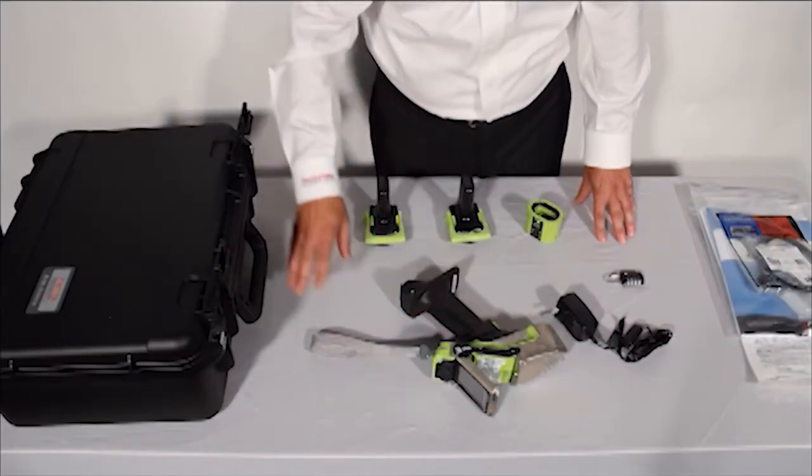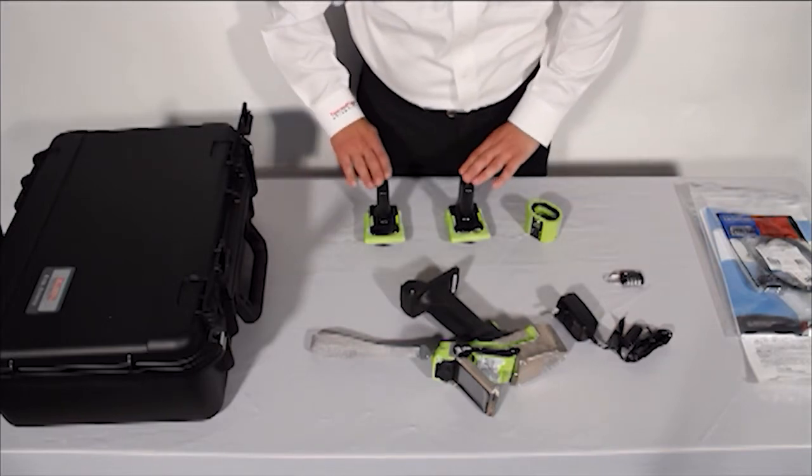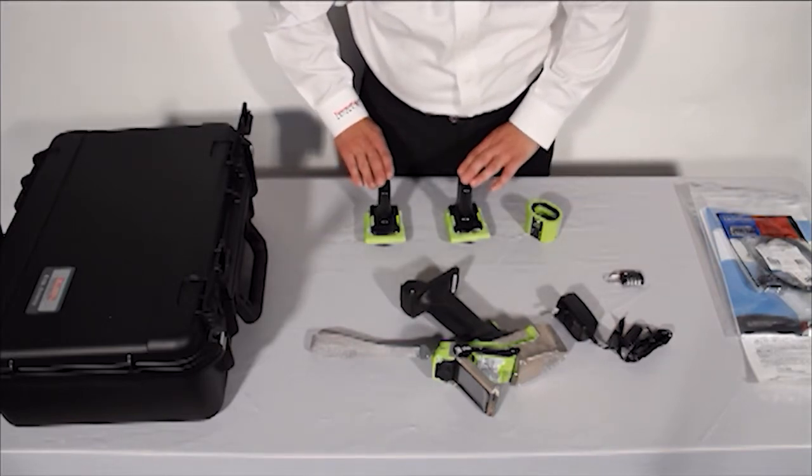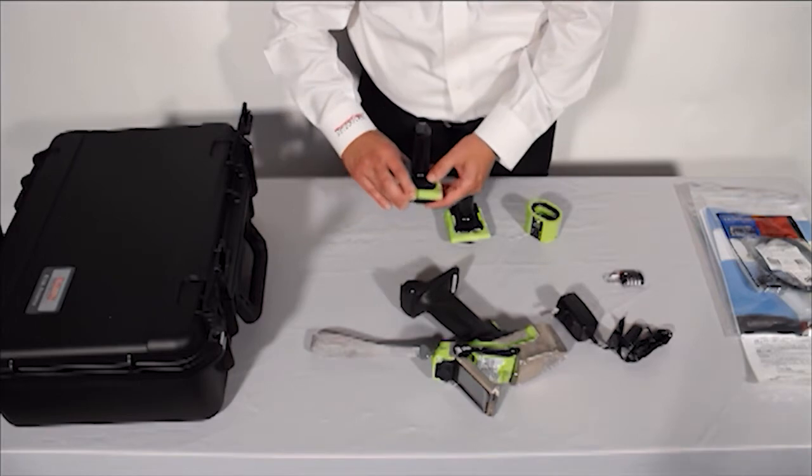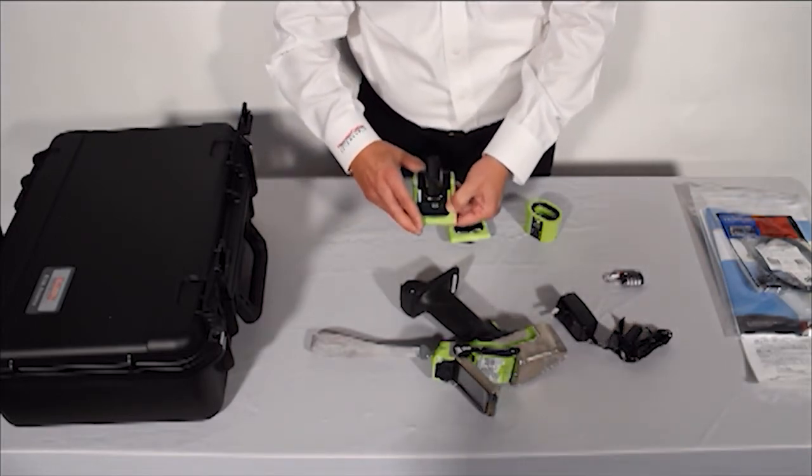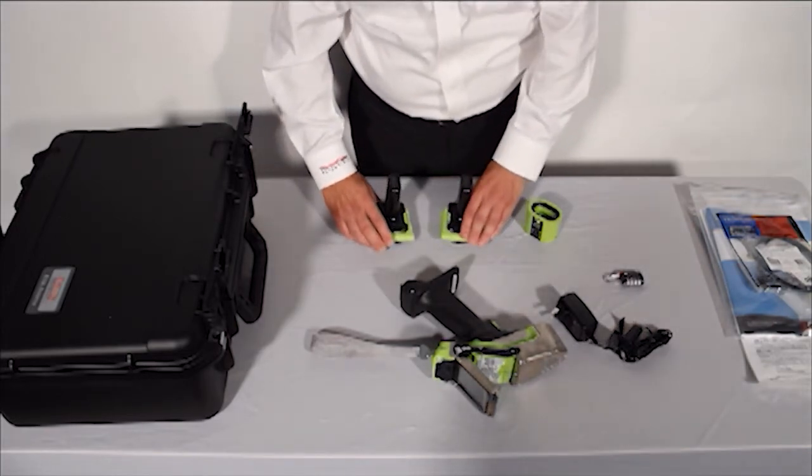From your carry case, you'll find the following: the analyzer itself and two batteries. Each battery has an indicator light. Press the button and it tells you the percent charge, whether it's ready to go or not.